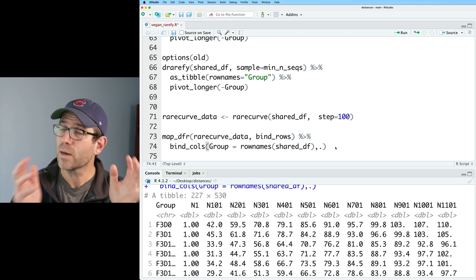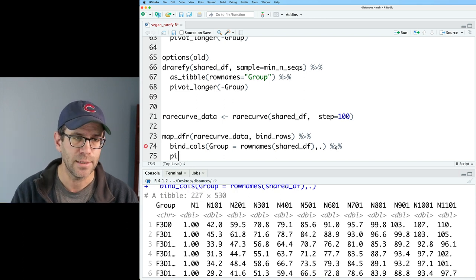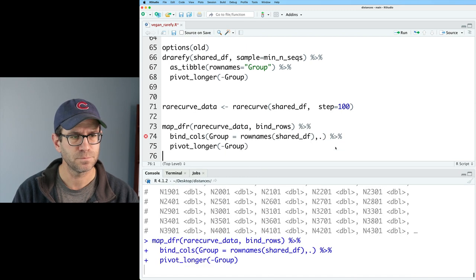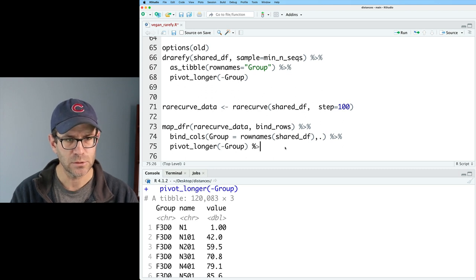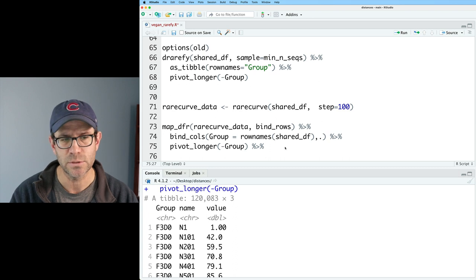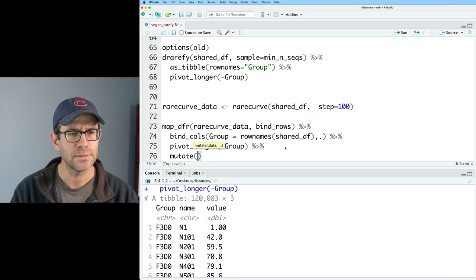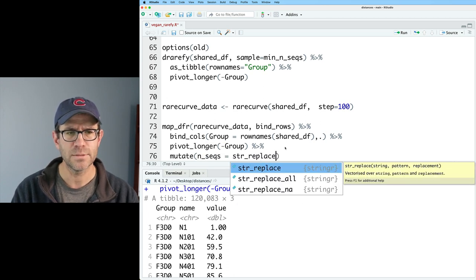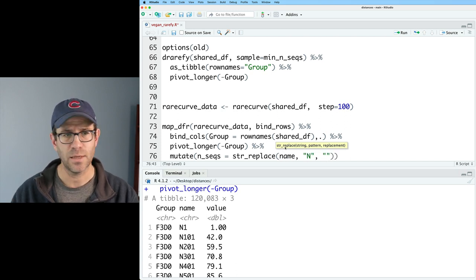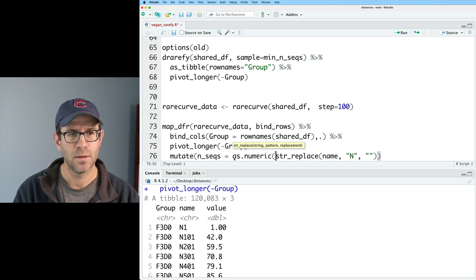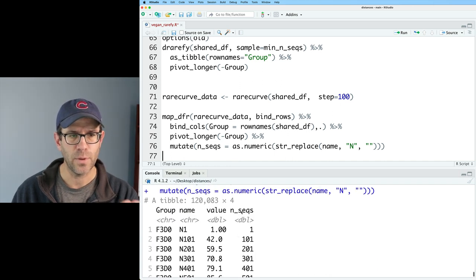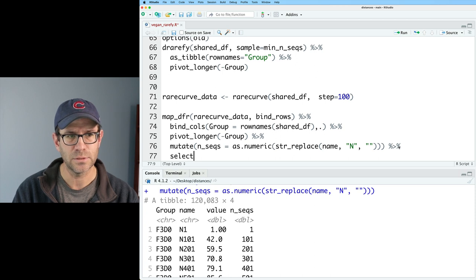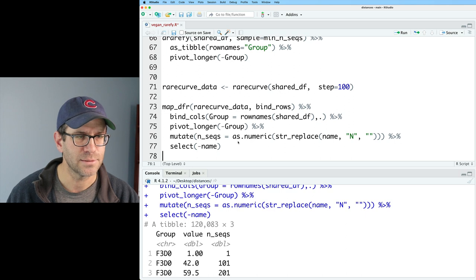So now, because I want to work towards putting this into ggplot to make the line plot, I need to go ahead and pivot_longer to make it tidy. So I'll do pivot_longer, and we'll do everything but the group column. Very good. And so the next thing I want to do is go ahead and take that name column and turn it into the number of sequences. It's currently a type character because it has the n and then the number. And so I'll do a mutate, and we'll do nseqs equals str_replace. And I will then say name, and I'm going to take the n and replace it with nothing. And I'm going to wrap this in as.numeric to convert the text into a number. And so sure enough, now we have nseqs as a double, and I can go ahead and do a select minus name.